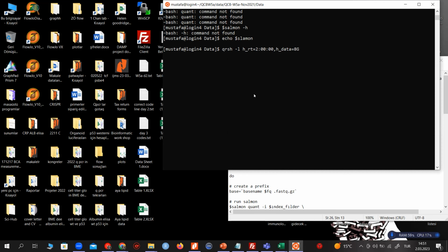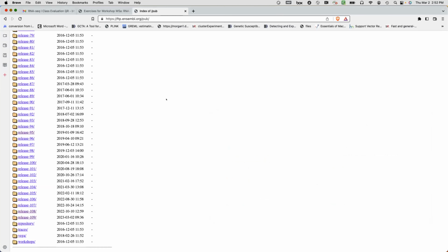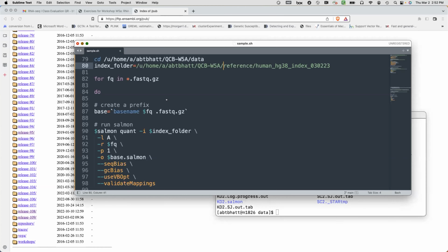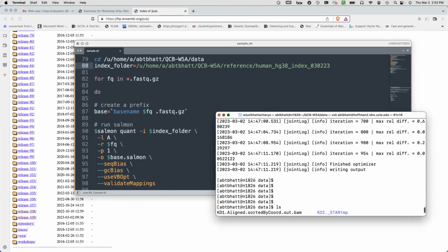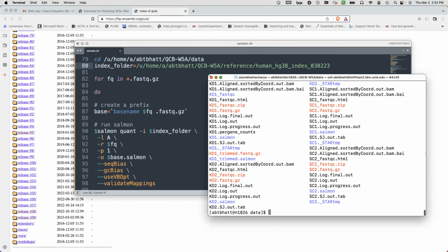Okay, so let me now share my screen. All right. Okay, so now I'm done. So let's take a minute and think about what we did.